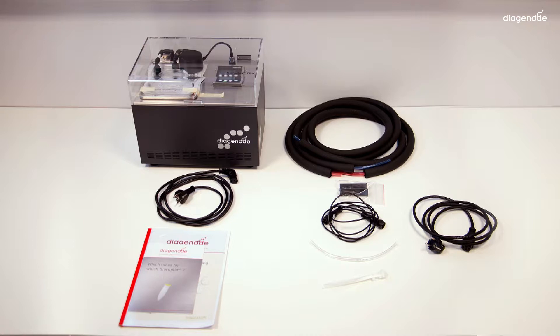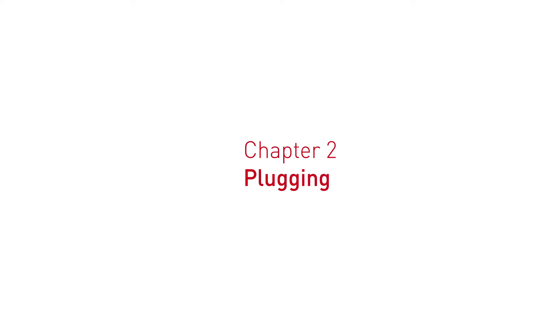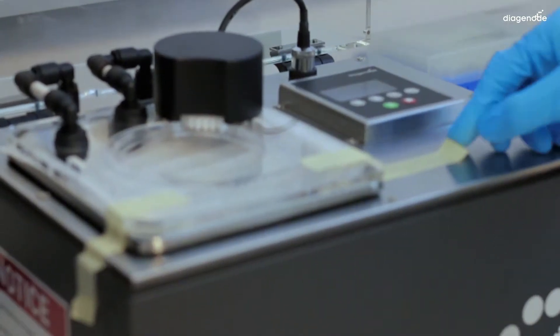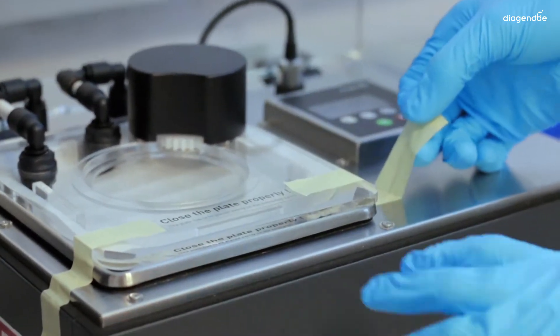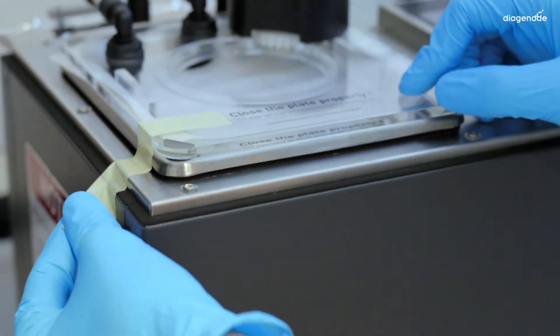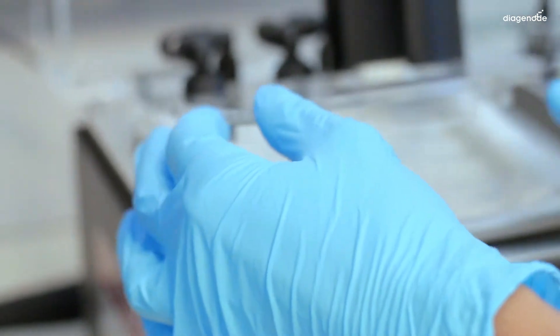You can identify all parts of your machine and check if all these parts are on your table. Then you can begin the installation. Before using it, you'll have to remove all the different protections. There is tape on the edge of the lid, two pieces of tape on the motor plate, and finally a protective sheet.